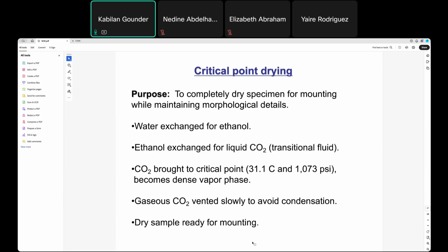What is interesting is that previously, for light microscopy, fluorescence microscopy, or laser capture microdissection, we did not dry the sample during this period. Drying the sample is only the last step: after you transfer onto the slide and stain it, only later do we dry the samples and observe.